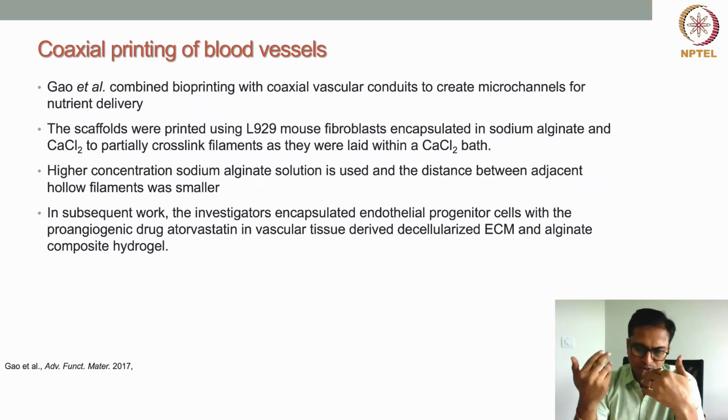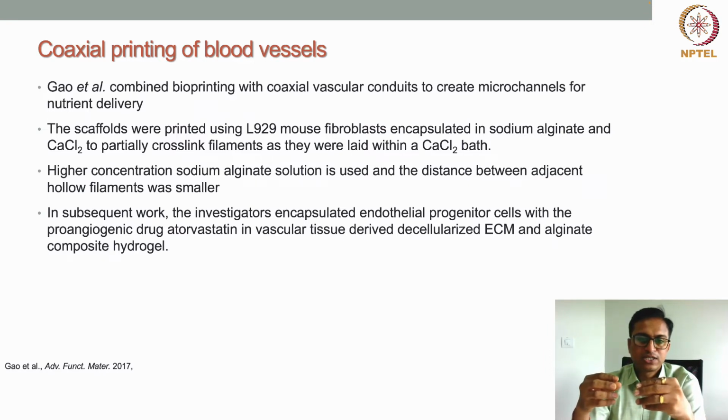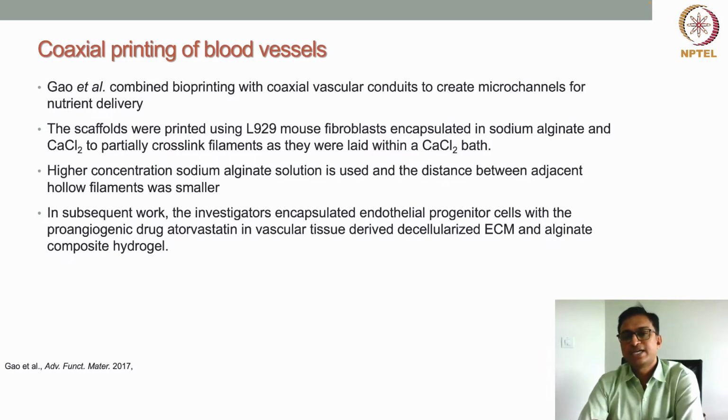They used a little higher sodium alginate concentration so that the structure retention would be better. First, the structure is solidified, the stability can be maintained, and the mechanical properties can also be good. So in this work they have shown the possibility of using this kind of open lumen, tube-like structure for bioprinting. This is a very significant advancement towards the development of freestanding vascular blood vessels, big blood vessels.